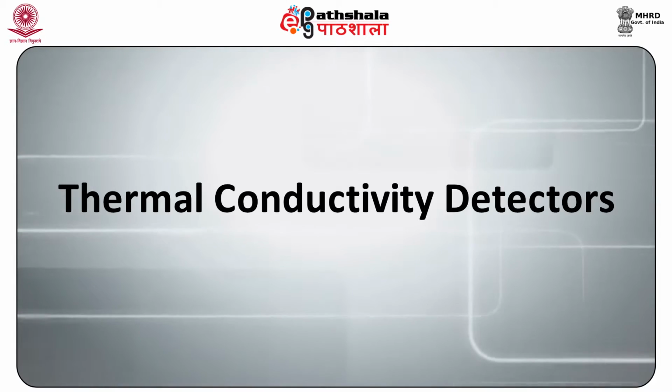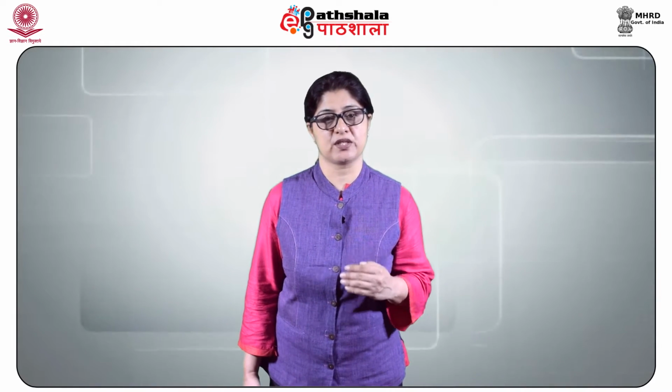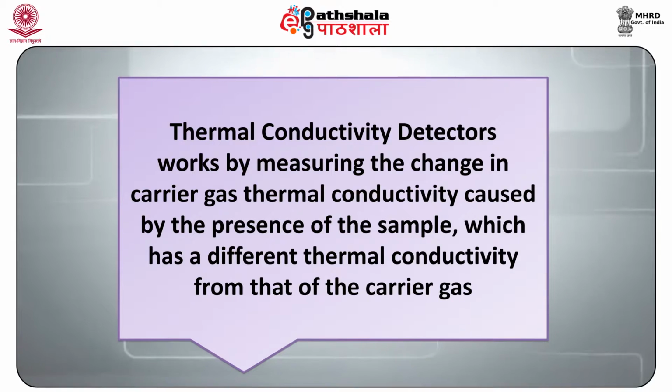Thermal conductivity detectors. Thermal conductivity detector (TCD) were the first detectors developed for the use with gas chromatography. The TCD works by measuring the change in carrier gas thermal conductivity caused by the presence of the sample, which has a different thermal conductivity from that of the carrier gas.